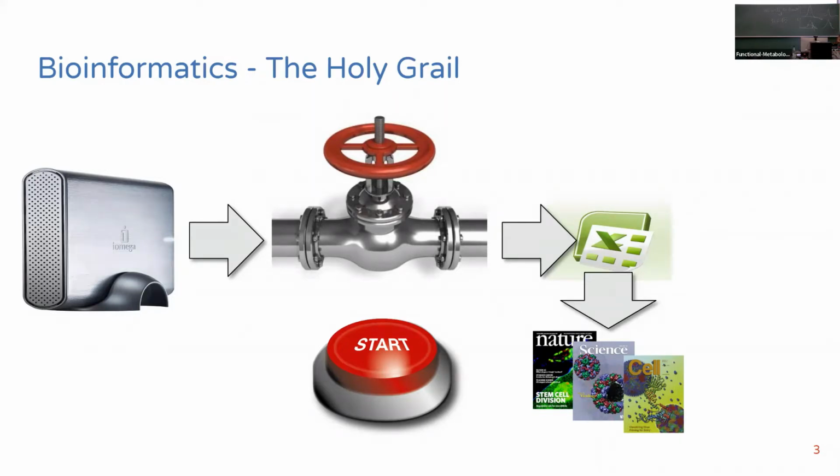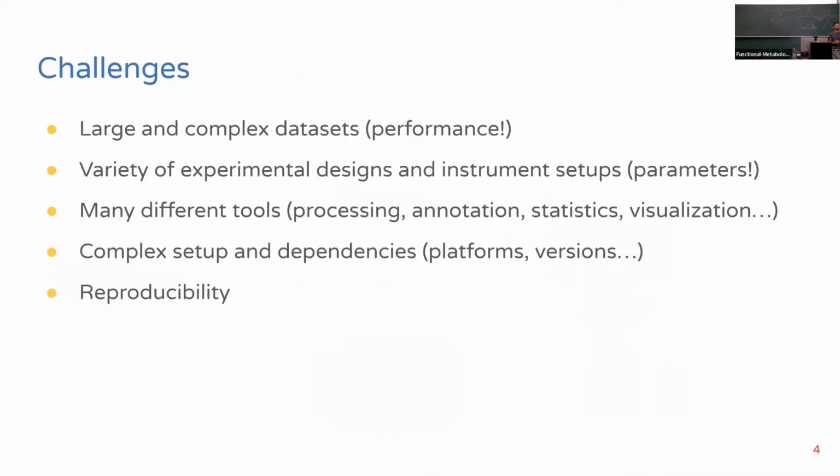Of course, that's not how we can do it, because there are some challenges, especially with mass spec data. Our sample sets are often large and very complex. So performance is definitely an issue here. If you have hundreds or even thousands of files to process, your typical laptop might struggle with that, and you might need to use a powerful PC that you have in your lab, or even upload your data to servers, high performance clusters.